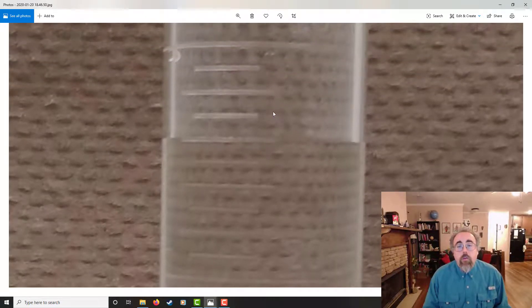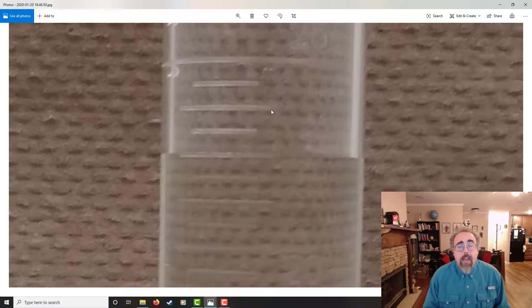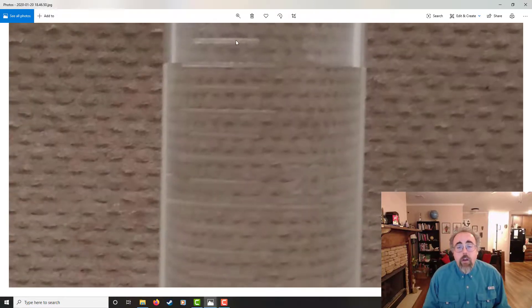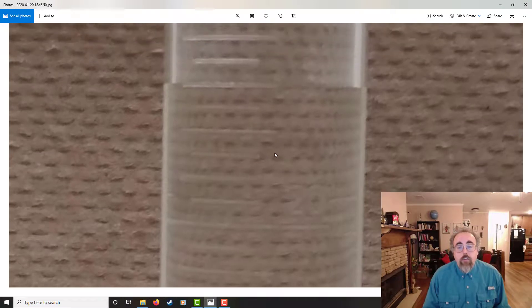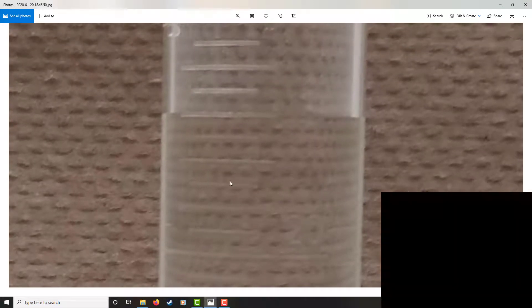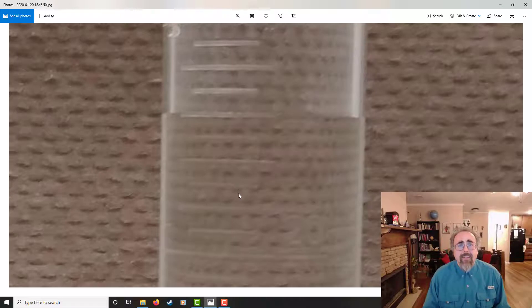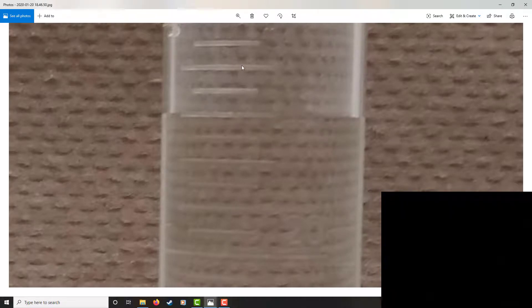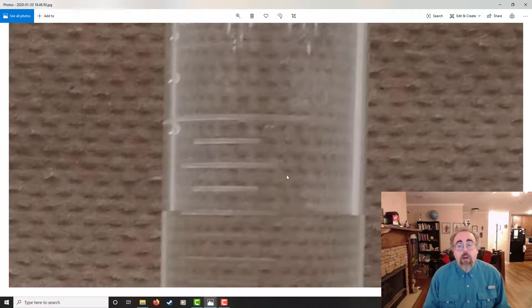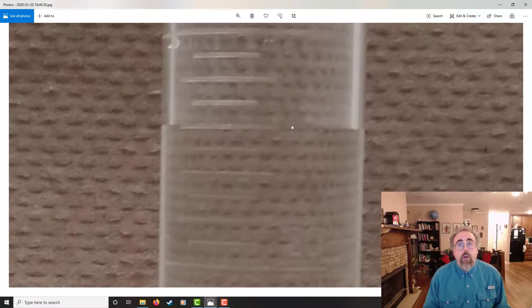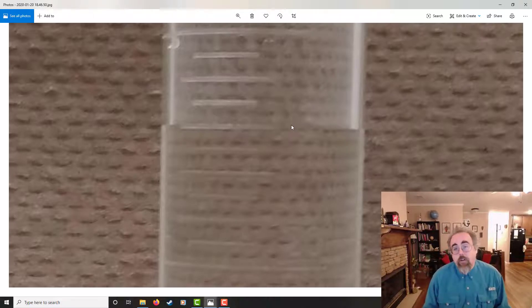So that's a really tiny meniscus. Okay, so this is a little bit harder to read. The camera did not like this one as well, but you've got the 25 mark there. You've got the 20 mark over here. So how many lines do we have? One, two, three. Notice how there's this alternating size. I think that's going to be important. One, two, three, four, five, six, seven, eight, nine, ten. Okay, so these are going in, there's ten increments, so it's going only five milliliters. So these are not going by milliliters, they're going by half milliliters.